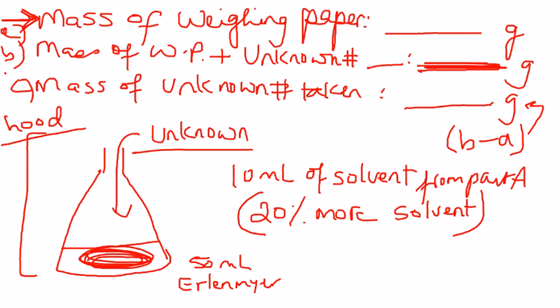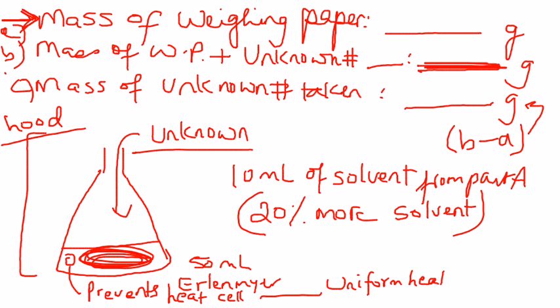It's a good idea to put a boiling chip in here as you are heating that, because a boiling chip prevents hot spots, and it allows uniform heating. So the liquid within your system would not just explode. So it's a safe way of heating.